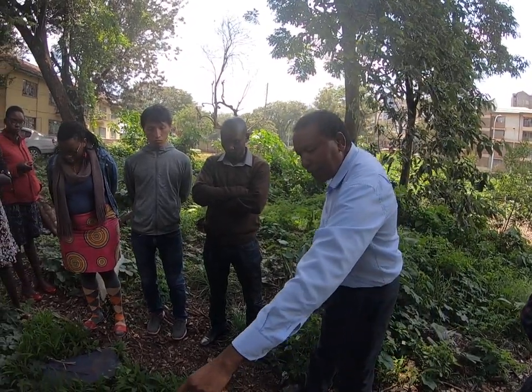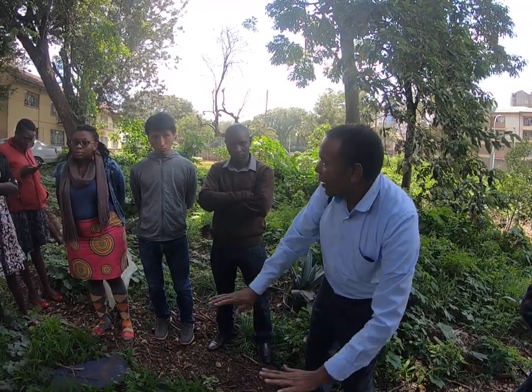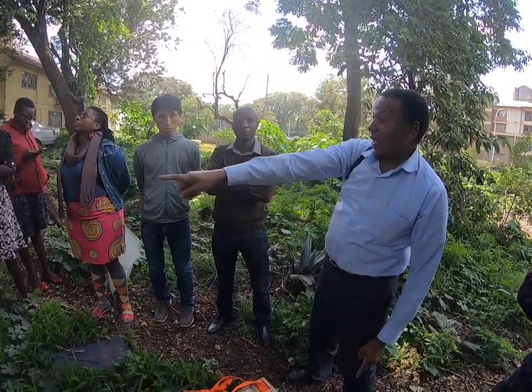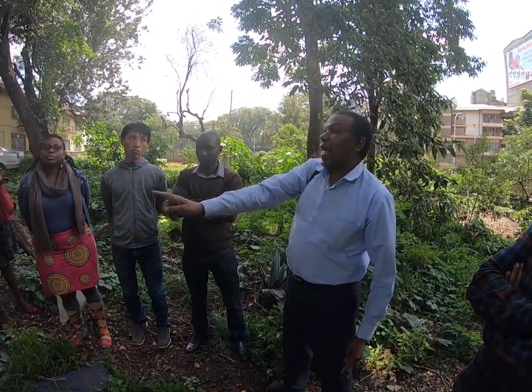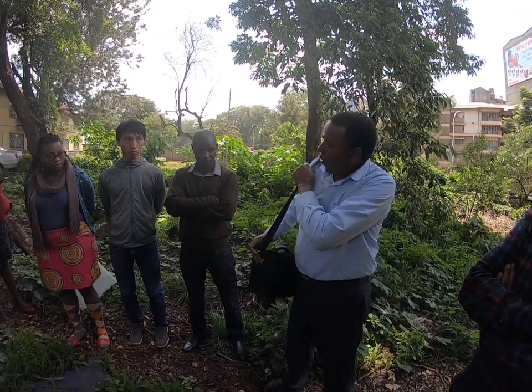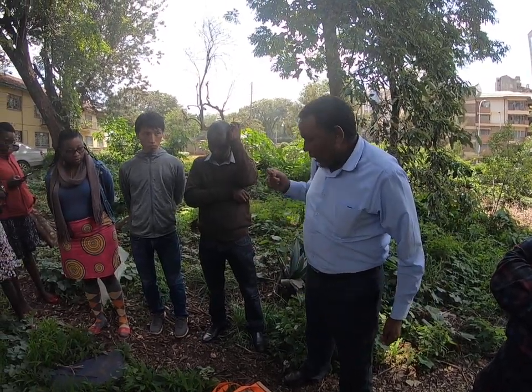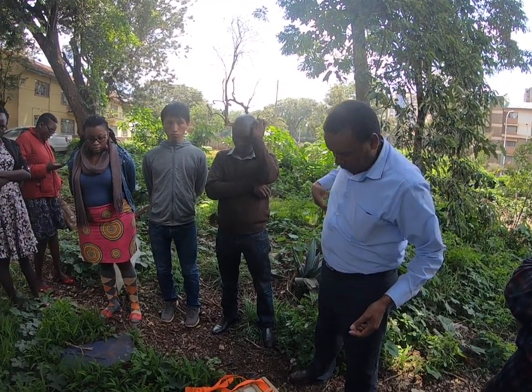Like now, the habit of this plant, what we are seeing, creeper, the habit is spreading, creeping. So this is a creeper. The habit of this is different from this. This is erect. It's a tree. So it's a different habit. So the camera is able to capture all that information, which you may not capture here, although I also bring a notebook and write information about the habit in my notebook.